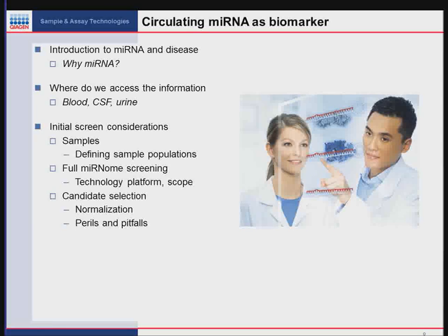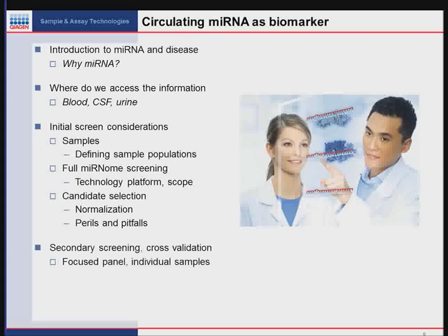We'll talk about initial screening considerations. How many samples? How do we define our sample population? How large of a library are we screening? What platform are we using? And then I'll talk about candidate selection for potential biomarkers, how we do normalization, some perils and pitfalls.